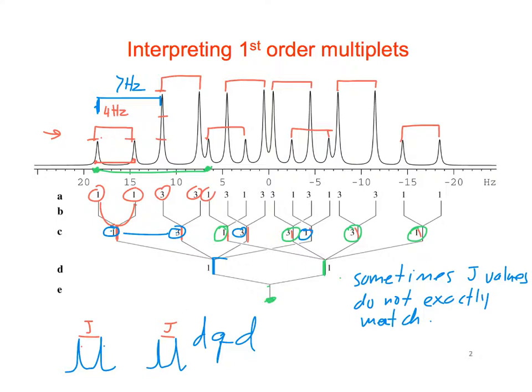So it's really more of an experimental issue, more of a data sampling issue usually. Because if you run a spectrum, pick out a big peak and expand it really big, and look at the peak, it's essentially created by a bunch of data points, right?